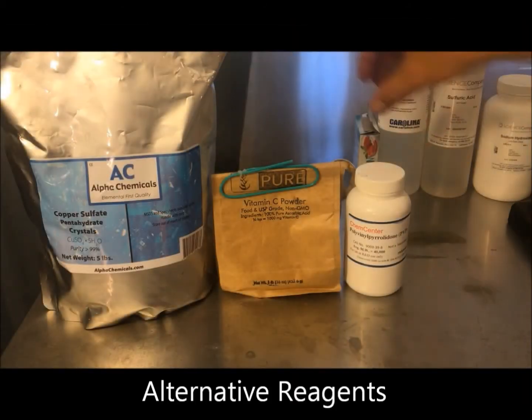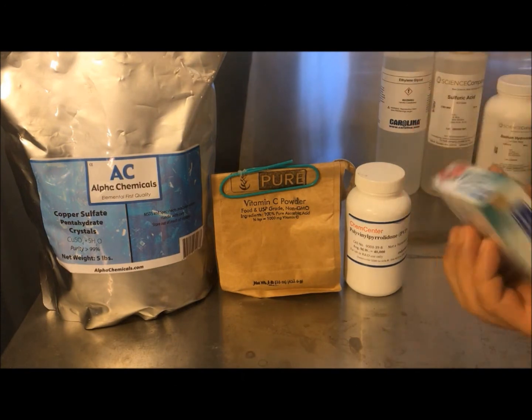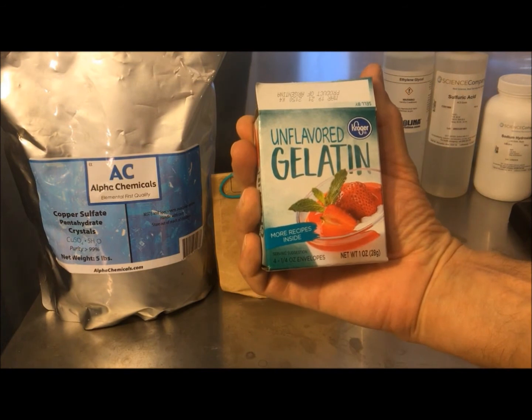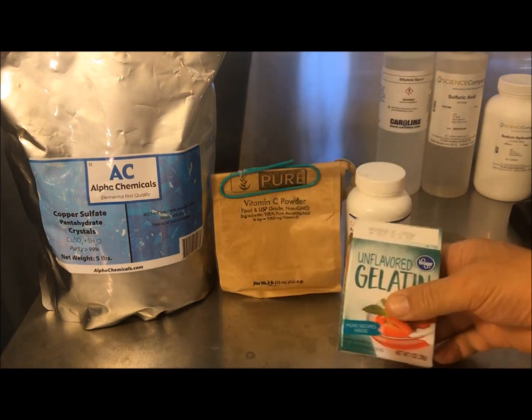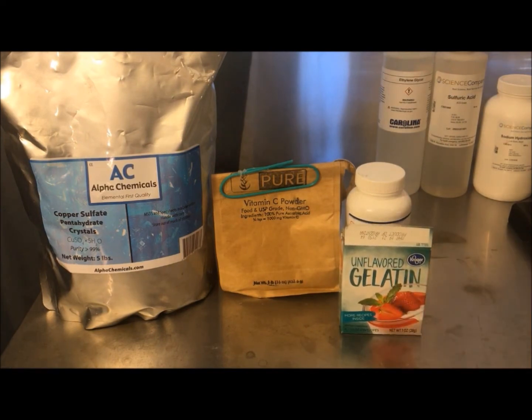One of the studies I read used gelatin as the capping agent, which I think they hydrolyzed to form long-chain amino acids and polypeptides. Basically, these capping agents are any kind of long-chain polymer that surround the copper ions in solution and affect their dispersion and size, which can range anywhere from a few up to 100 nanometers in diameter.